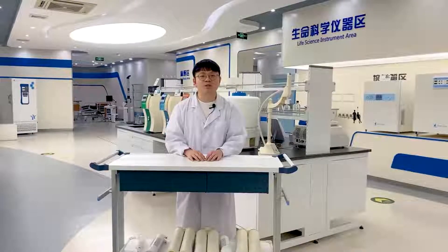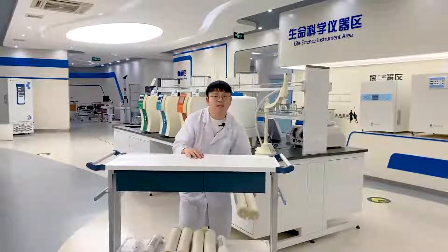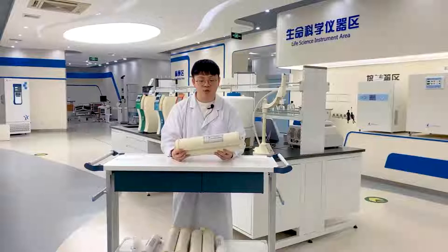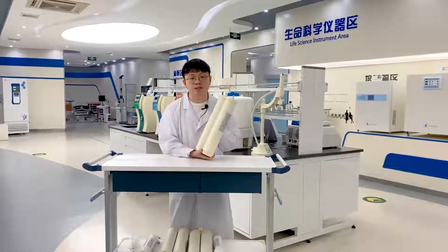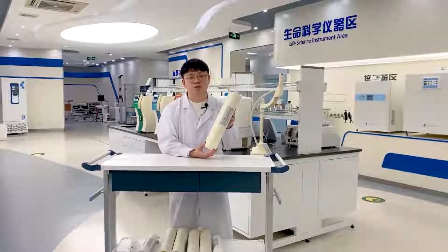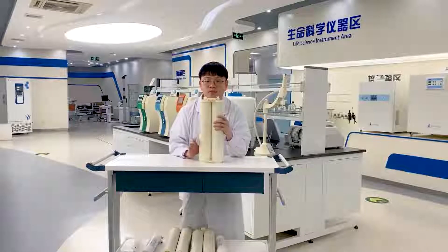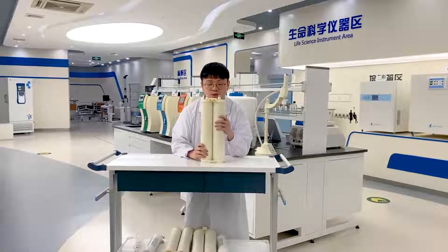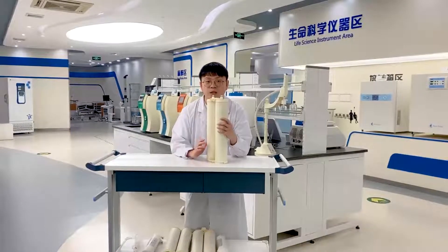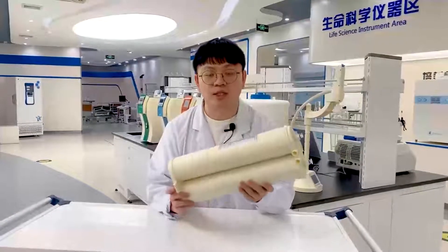Now we will introduce our consumables and the process to purify the water. We have a pre-treatment cartridge with PP cotton and active carbon to protect the RO module and reduce large particulates. If your feed water quality is not very good, we suggest adding an extra pre-treatment cartridge to further protect the RO module.